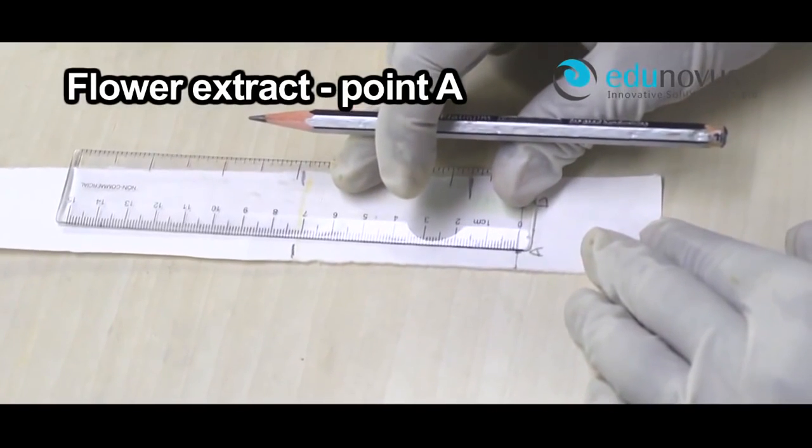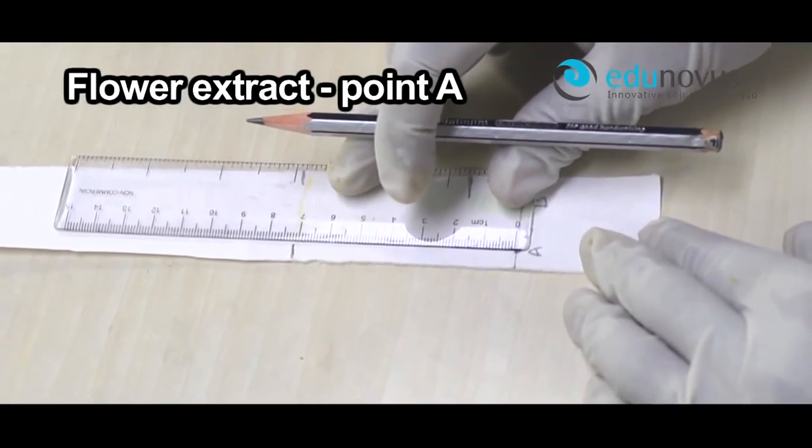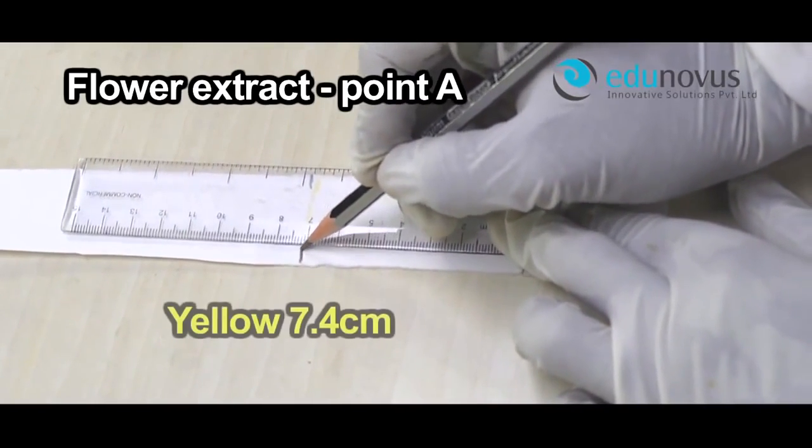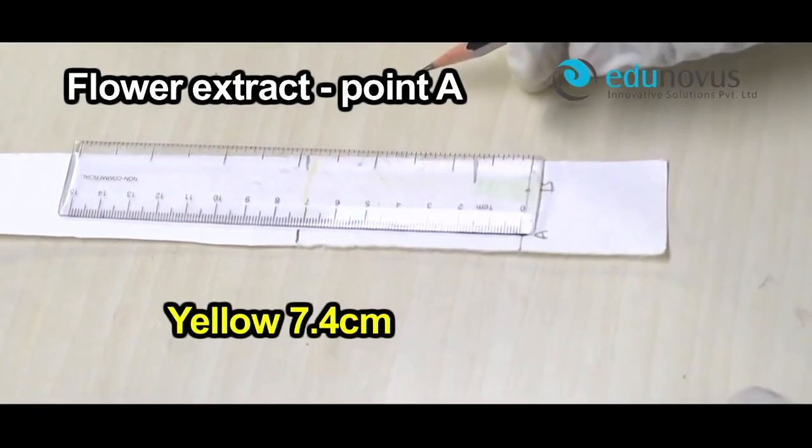In case of flower extract point A, we find only one color spot that is yellow, and the distance traveled by the yellow spot is 7.4 cm.